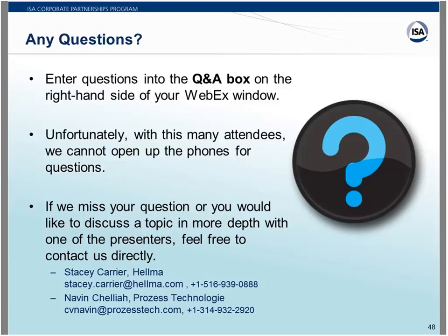The second question, what is the range of application, the percent moisture content wet basis for spectroscopy? That answers my previous response. The range of application is 1% moisture, so any moisture content below 1% cannot be measured using near-infrared spectroscopy. Again, 1% is equivalent to 10,000 ppm.